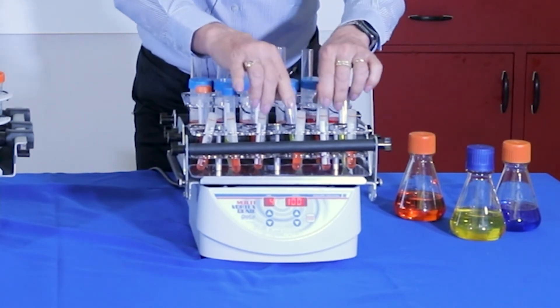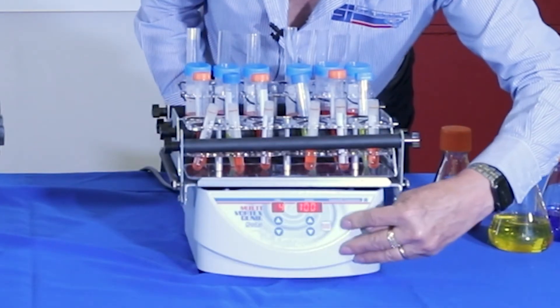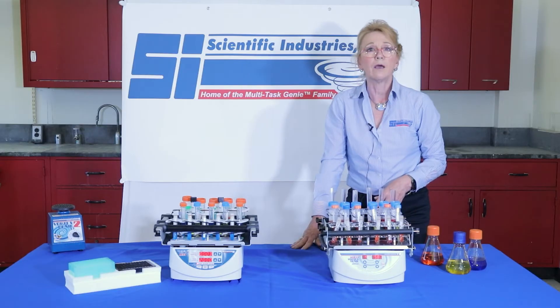Always check your tubes are secure — you don't want to pop one out as it's vortexing. Then just hit run. Set your speed and your time, hit start, and let it go.